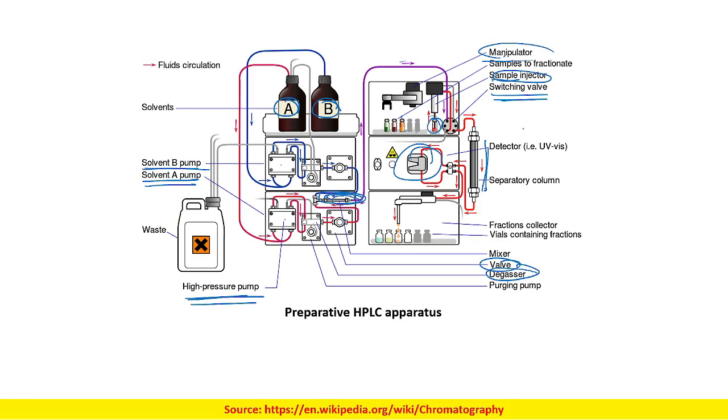Okay, now as I told you, there are two types of sample injecting system. One is like this, where you have a robotic arm. Now this robotic arm will take this sample holder and bring it over here, and then it will be injecting. Another type of sample injector is where you have these bottles which are kept at the same place.